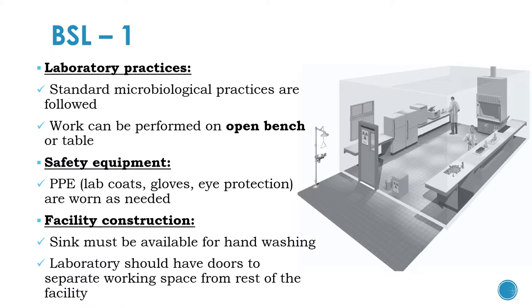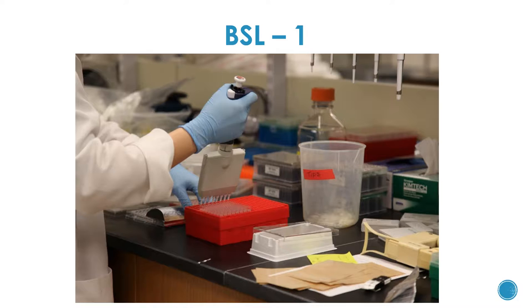Biosafety level 1: the microbes here are not known to cause disease in healthy adults and present minimal potential hazard to laboratorians and the environment. An example is a non-pathogenic strain of E. coli. Standard microbiological practices are followed and work can be performed on an open bench or table. Safety equipment includes personal protective equipment like lab coats, gloves and eye protection worn as needed. The facility must have a sink for hand washing and doors to separate the working space from the rest of the facility.